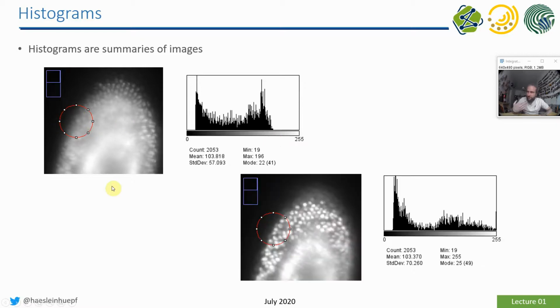When I change the configuration of the microscope, the contrast becomes higher. Higher contrast means a wider distribution of gray values in this image, and it also shows here that this additional peak on the right has gone, and we distributed these pixel intensities over more different gray values, and that's why we can suddenly see nuclei in this original image. So the histogram tells us a bit about image quality, so differentiability of different objects. You can see that in the histogram.